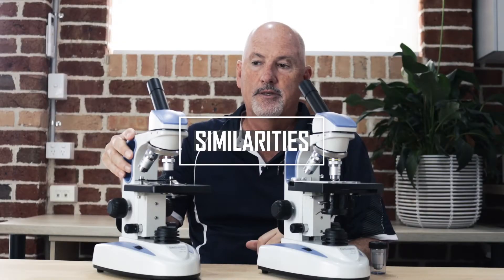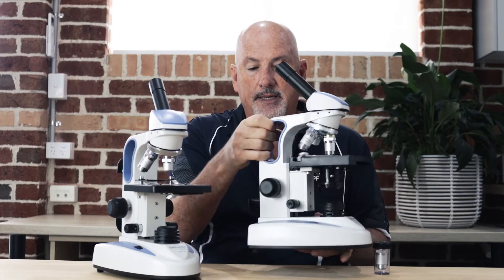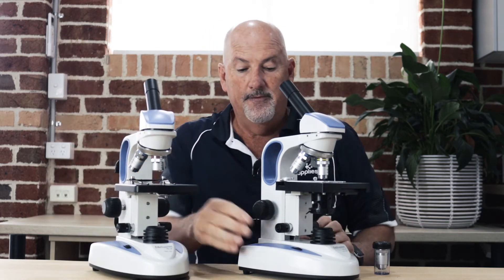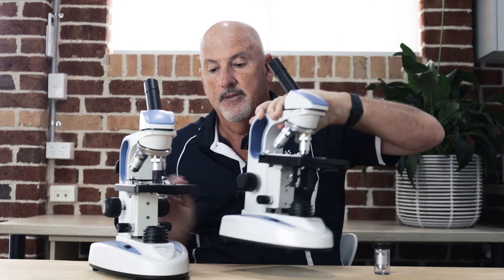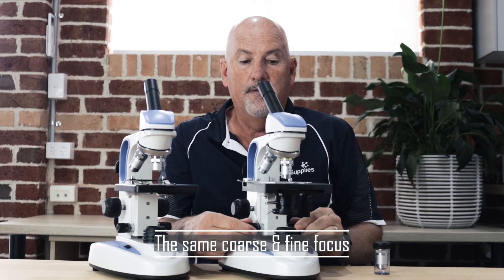Both microscopes have a rotating head, a nice little handle that you can pick it up with, and somewhere to store the electrical cable. It has variable light on top — not down the side, so it doesn't get bumped and knocked around. It has an on/off switch at the back so it can't get bumped when you're placing them together, and it has the coarse and fine focus.